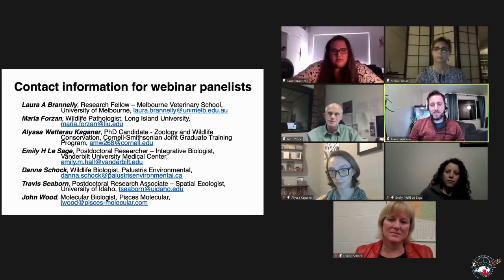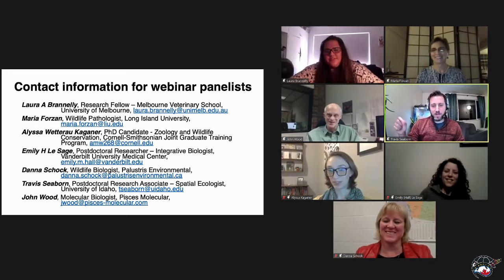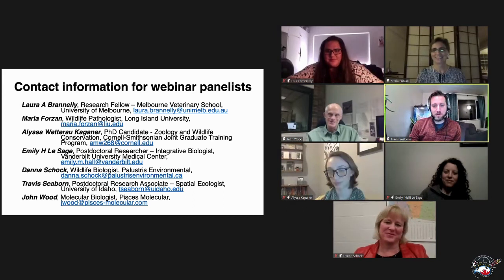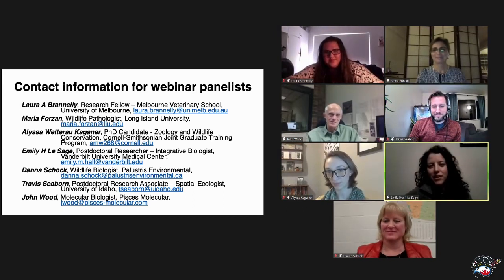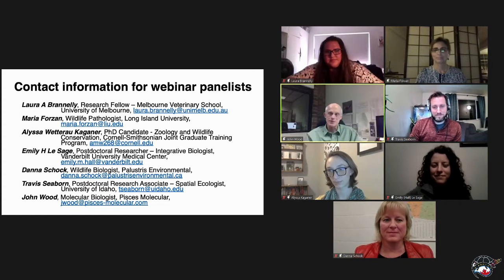Also, I like silica because I have tipped over my little ethanol vial in the field, in particular when it's really windy, or you have one where the screw cap's not down quite all the way. So that's my personal bias too, in terms of what works better for me under crummy field conditions. Yeah, and you can just use little coin envelopes. They're really cheap, and just stick the filter in the coin envelope, and then it doesn't touch the beads at all. Yes, Emily. Yes, we've told people that.